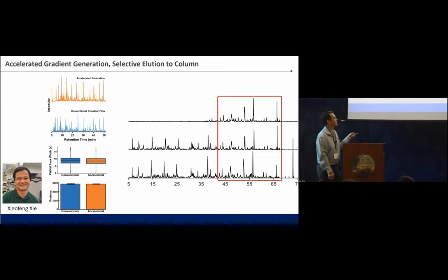And so that's really good. Now we need to make it faster, right? And so sadly, we had to sacrifice this really nicely working platform for a while. Where we want to go is separations that are fast, have a high peak capacity, a low flow, and a 100% duty cycle. And this separation that T has been working on basically gets 3 of the 4, right? We haven't multiplexed this yet, but within 4 or 5 minutes, this is a separation that typically takes an hour to have this peak capacity. We're getting it in less than 5 minutes.